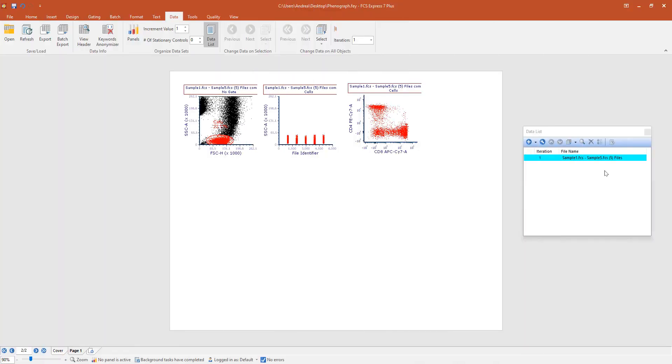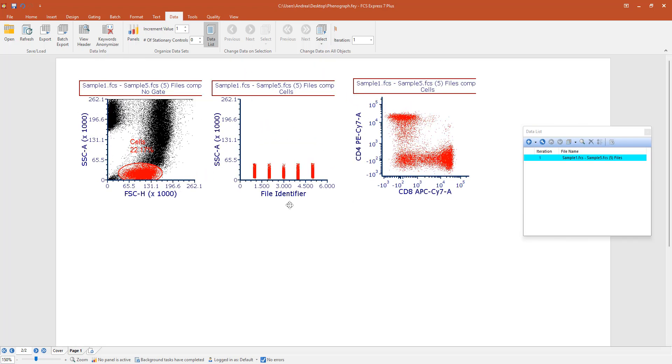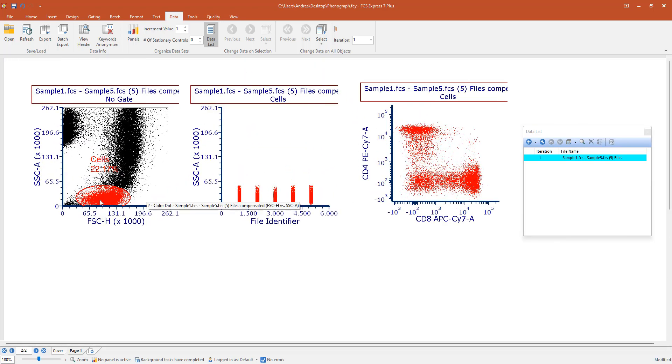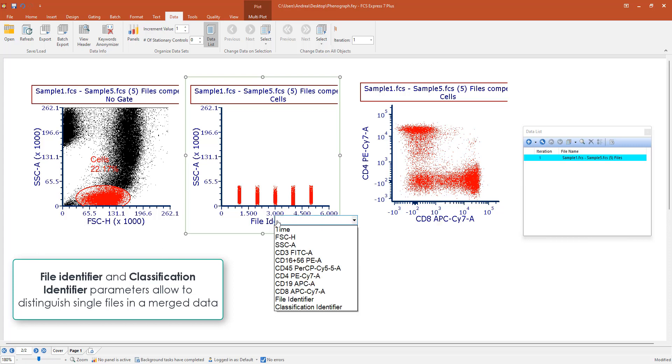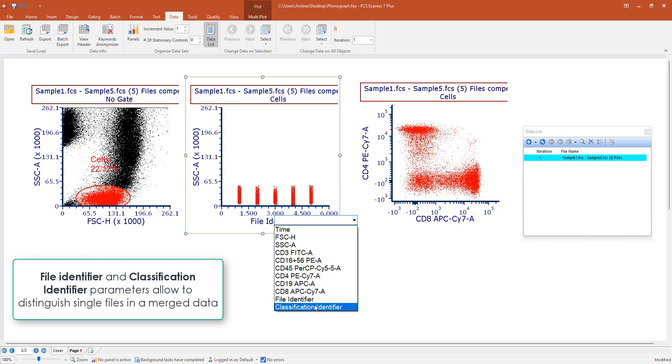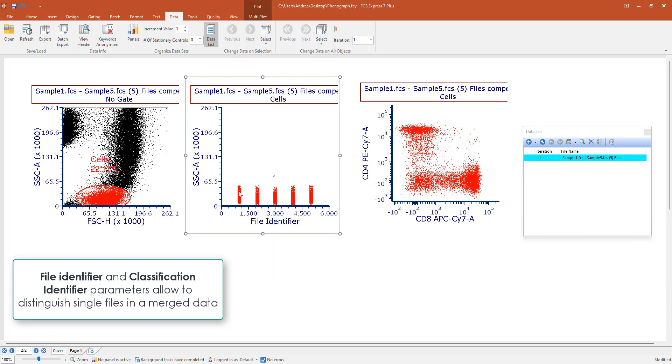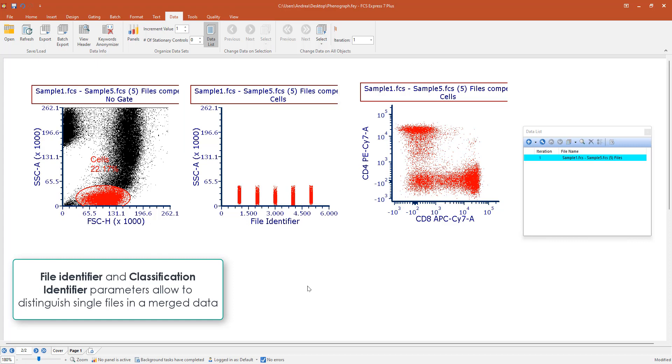In this example, I have already loaded my samples as merged data into the data list and I opened a few plots and also created a gate around the population of interest. I want to mention that every time you merge data together, FCS Express will create a file identifier and a classification identifier parameter that will allow you to distinguish each single file even after the merge.